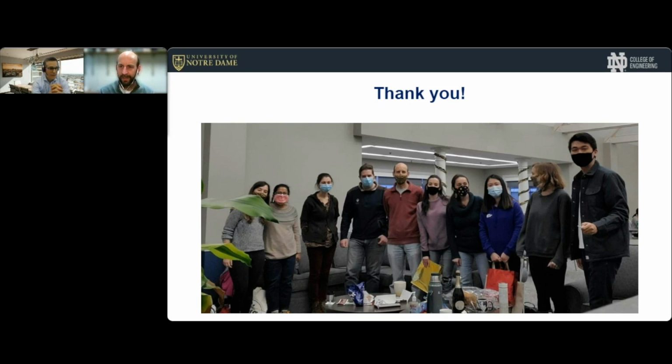Thank you. The next question is from Nicoletta Torja from the National Institute for R&D of Isotopic and Molecular Technologies in Cluj-Napoca. What is the meaning of the upper interrupted line in the OCT image of the biofilm inside of the reactor? I think you're referring to that line that we saw develop over time in the counter-diffusional biofilm, this band of high-density OCT signal. And I hope I'm answering the correct question.